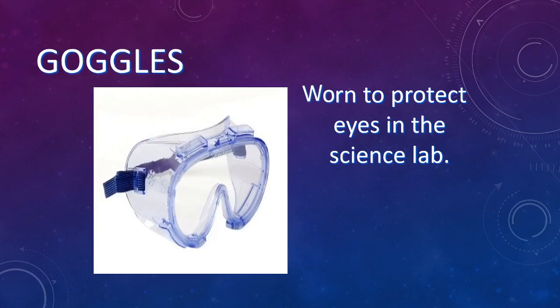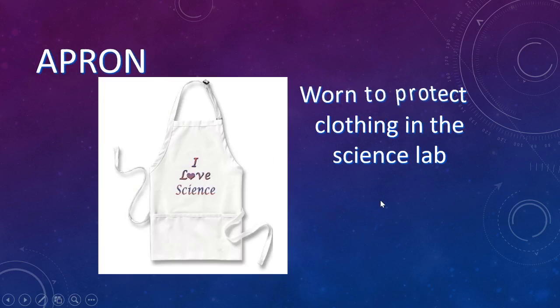Next is goggles. These are worn to protect your eyes while in the science lab. You're going to wear these almost every time you come into the lab — if you're working with chemicals, dissecting any animals, or anything that could be harmful for your eyes.